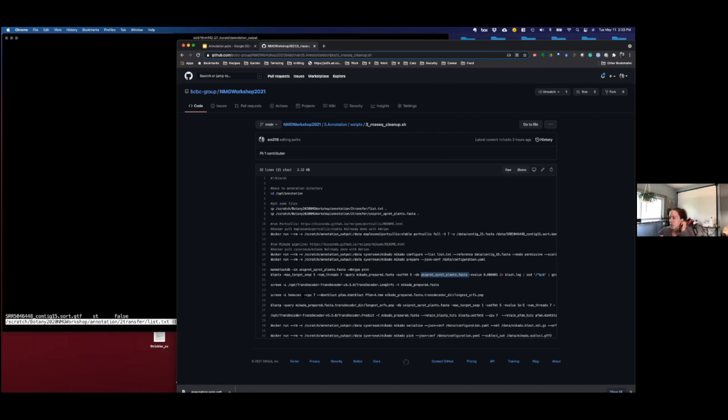The reason this is really nice is because not only does it give you a first pass annotation, which misses a lot of stuff because you're only really basing this off the RNA-seq, but the output is usually pretty accurate. So it allows you to come up with a training set for the later steps of the pipeline. Whenever you're training Augustus, SNAP, or GeneMark, the output of this gives you a nice set of fairly accurate genes that you can then use as training sets.